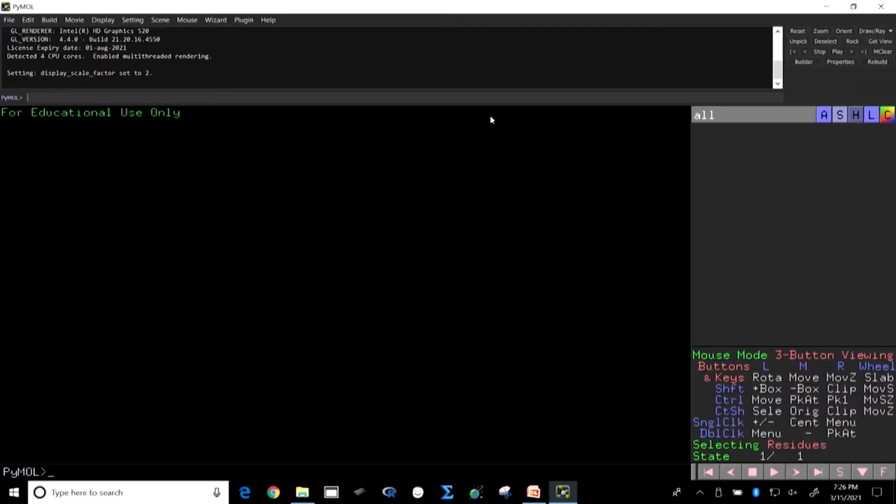With that, I will show you the demonstration of different aspects of Pymol. So, now you see this is the software Pymol as I was talking about. This is the educational version, so it is for educational use only. As I told, here you could write comments. First let us load a biological macromolecule.